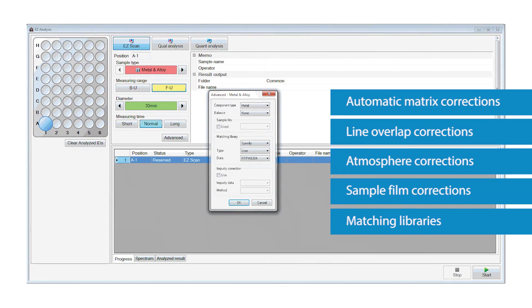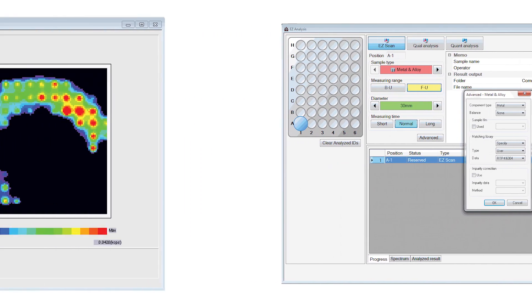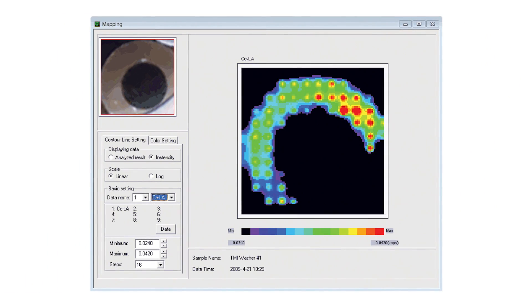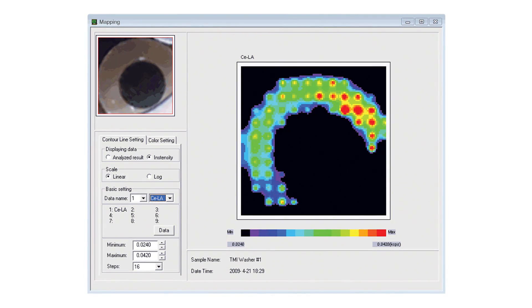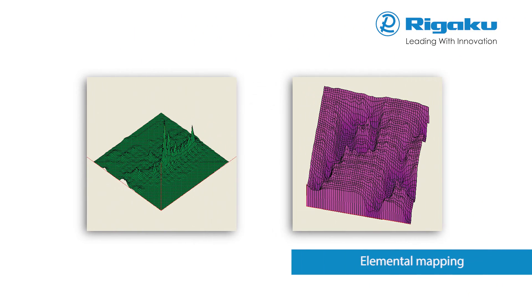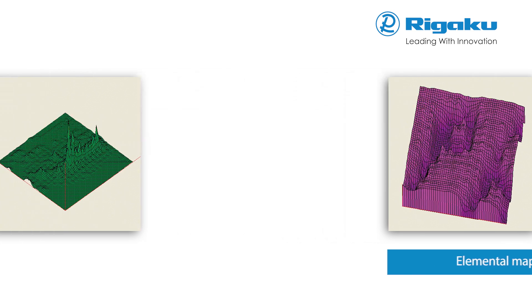Increased accuracy is achieved by using a matching library. ZSX Primus series spectrometers can be configured with micromapping capabilities, allowing measurement areas as small as 500 microns. Elemental mapping provides valuable information about sample uniformity and allows quantification of small regions of a sample.